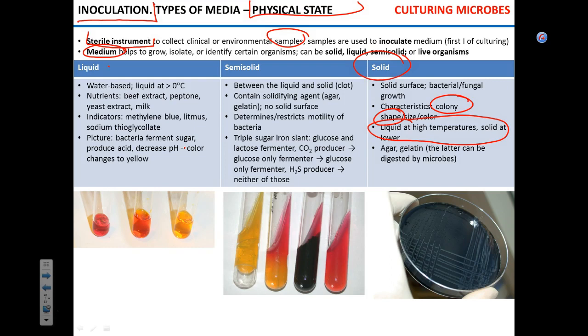Now, liquid medium here is water-based, and we call it liquid because it's liquid at room temperature, basically. It can contain various types of nutrient supplements like extract of beef or extract of milk or yeast, something that has proteins, fats, carbohydrates.